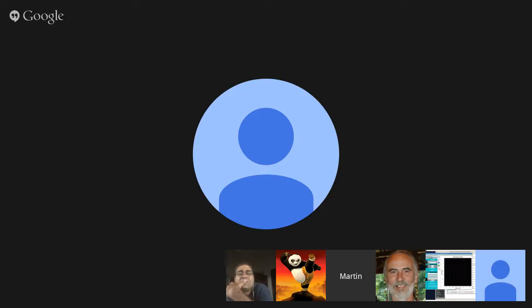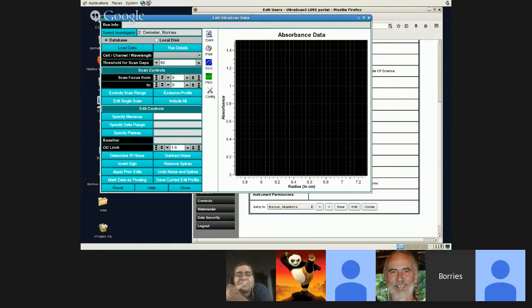And when you try some different database, for example from Europe, does it work or no? When you use it in Europe, you're using a different database. Yeah, that's right. So I'm not really sure what the issue is with the LIMS server in India. We've just set that up recently, and for some reason it's not working correctly today.